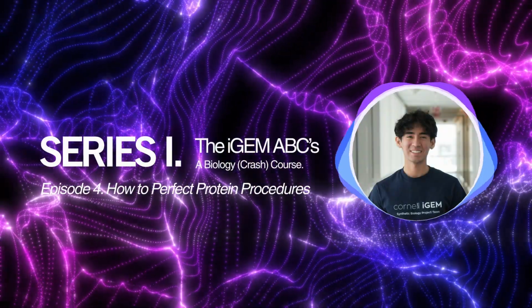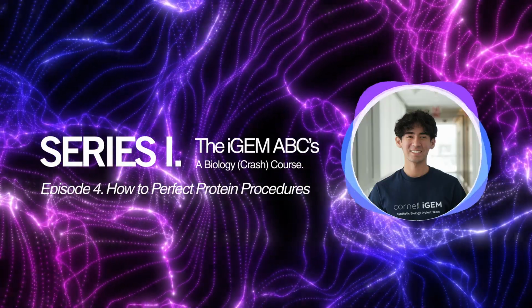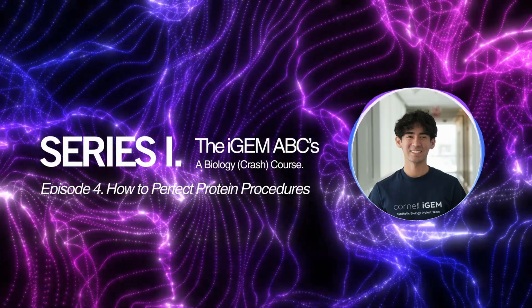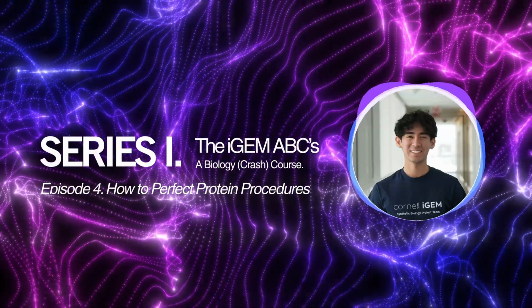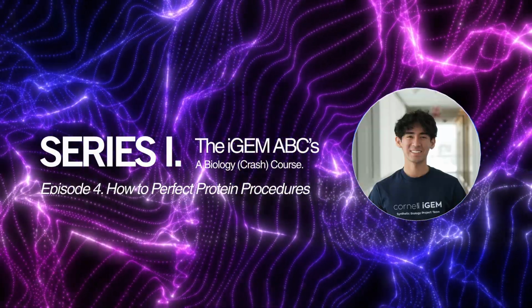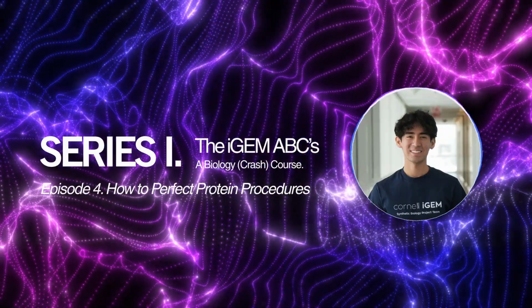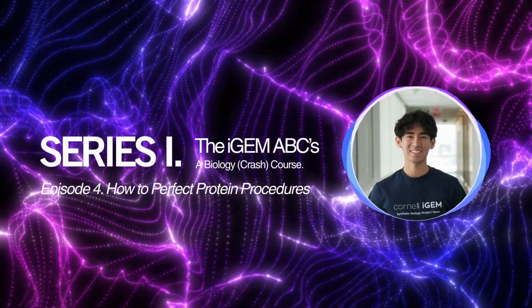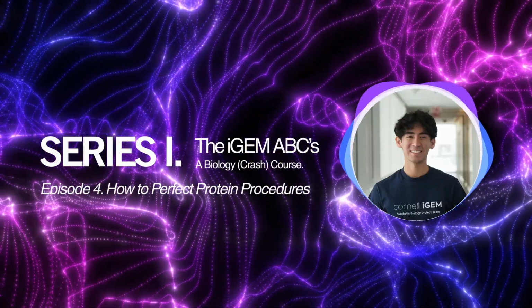In this episode, we're going to be going through a lot of technical terms. Here's a few of them: lysate, supernatant, pellet, denaturing, elution, and OD600. We're going to define all of these terms, so don't worry if you hear them and you don't immediately know what they mean. Today's episode is very information dense, so I have a couple of tips before we start. Of course, it's best if you are caught up with the series, but if you're not entirely caught up, listen for words that you do know to explain words that you don't know.